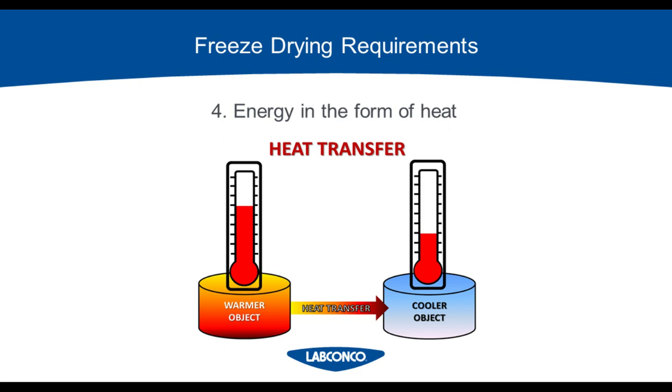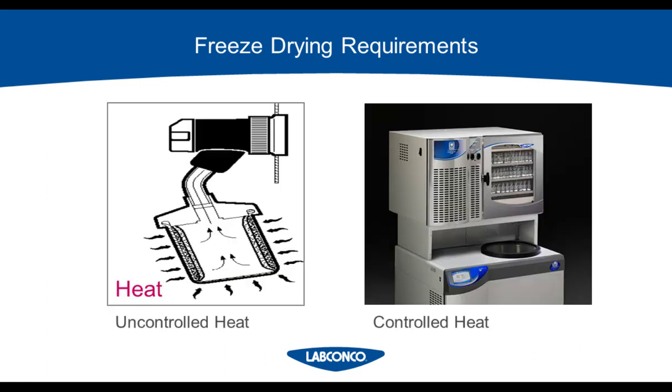In general, the more heat you're able to apply to your samples, the faster your run will go. However, not all samples can take the same amount of heat input. If you add too much heat to certain samples, you could cause your samples to melt.